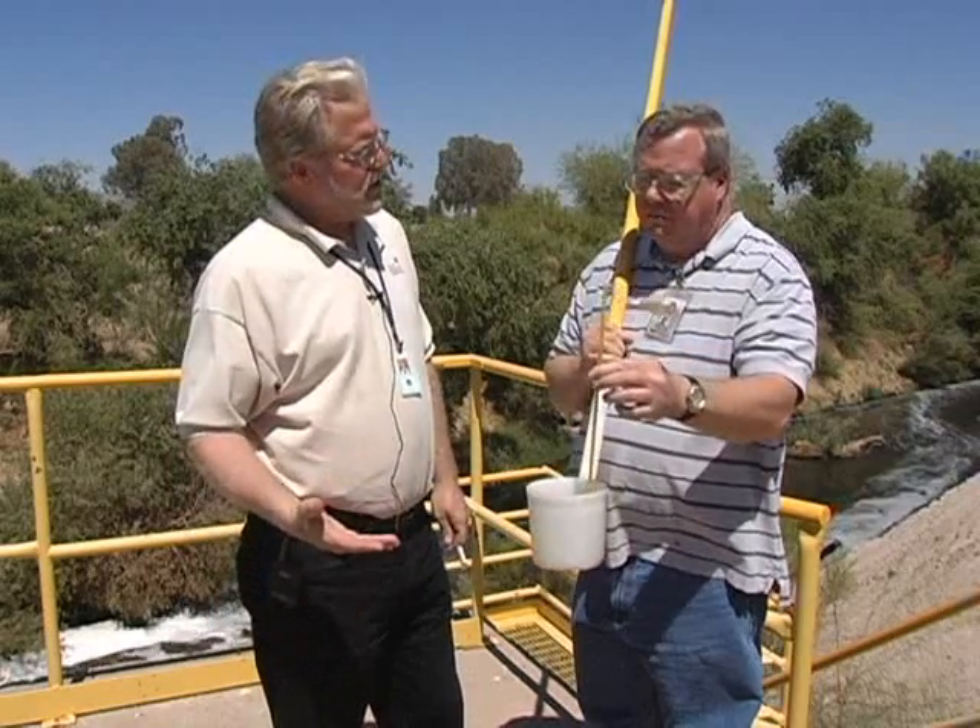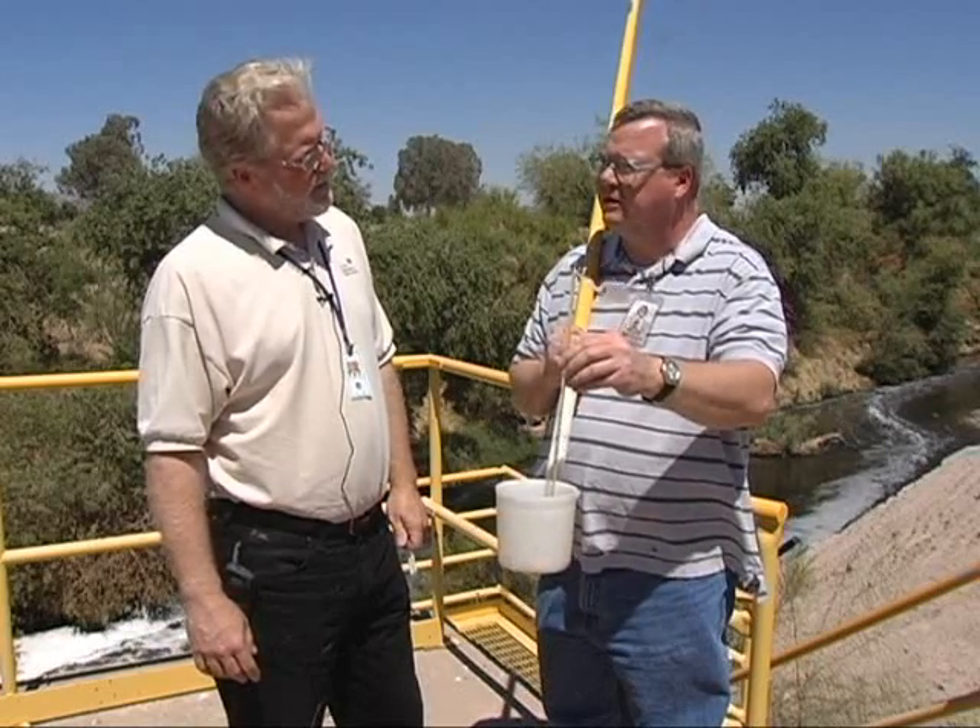This method requires that you take duplicates. Is that something you do down here? We do a duplicate once a week, as required. What we'll do is take this temperature — the initial one — and then when I do the duplicate, I'll repeat the process: get a whole fresh new sample, rinse it out three times, get my sample, and take the temperature. That'll be my duplicate.